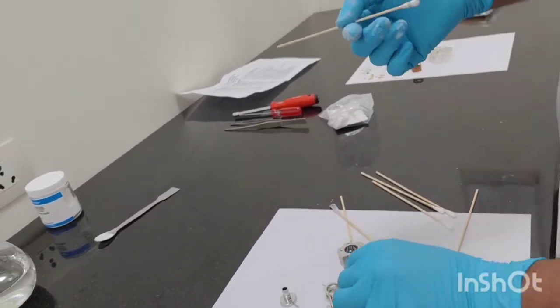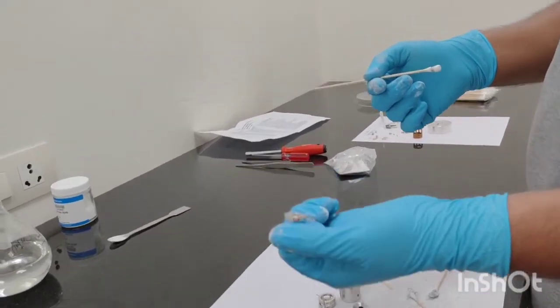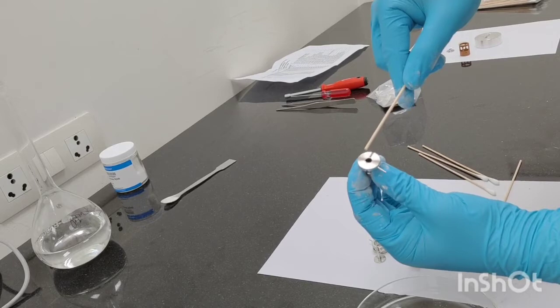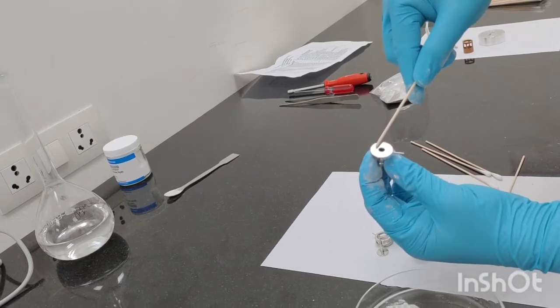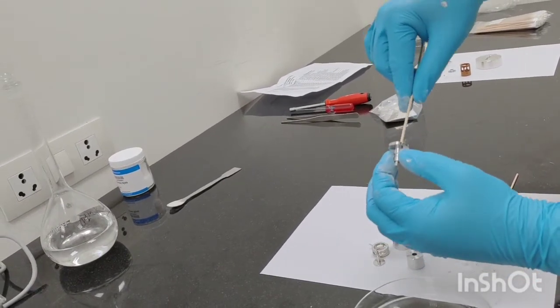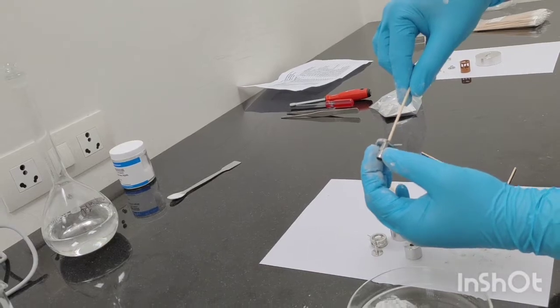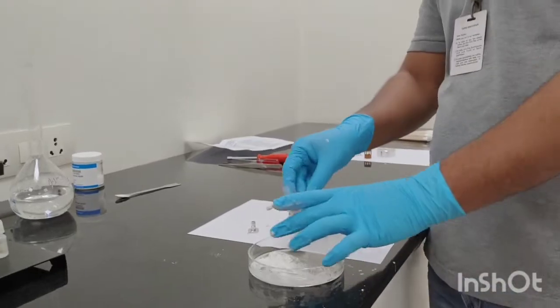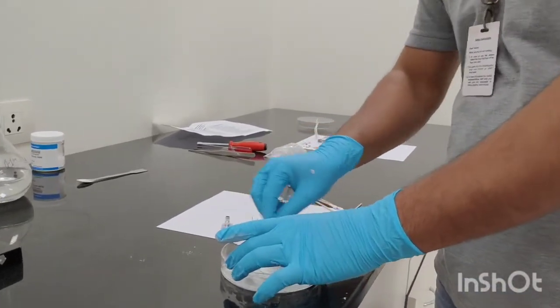Usually when the ion source is contaminated, at this particular point you will find some kind of black spot, but at present it is not there in this particular source. This is your entrance lens — particularly this part gets contaminated and requires to be cleaned properly. Overall we will be cleaning all the parts completely to avoid any kind of contamination, both visible and not visible.